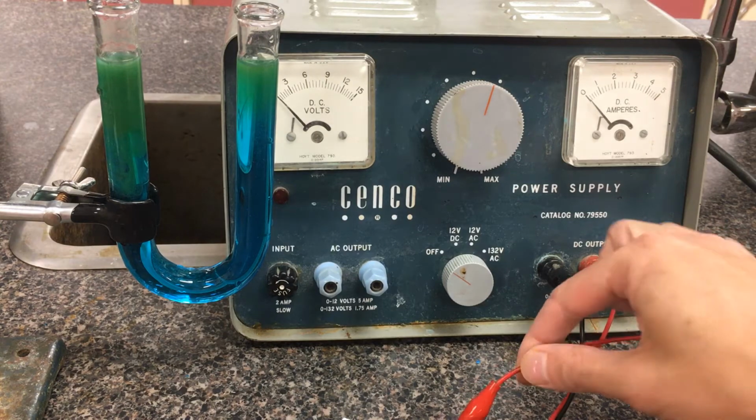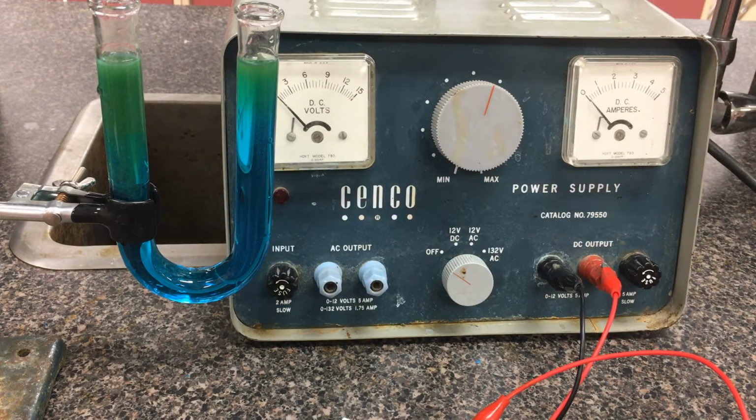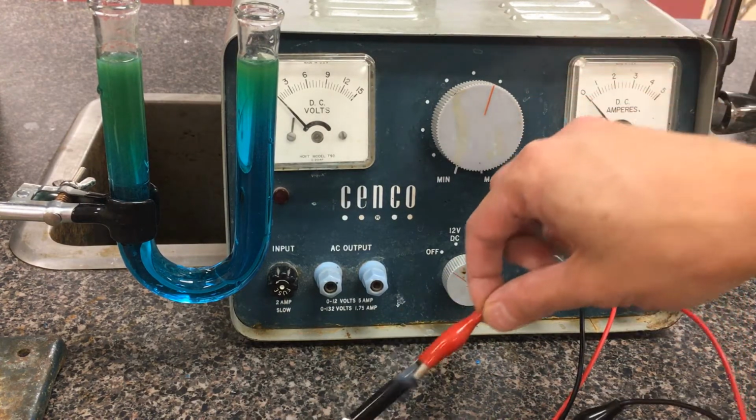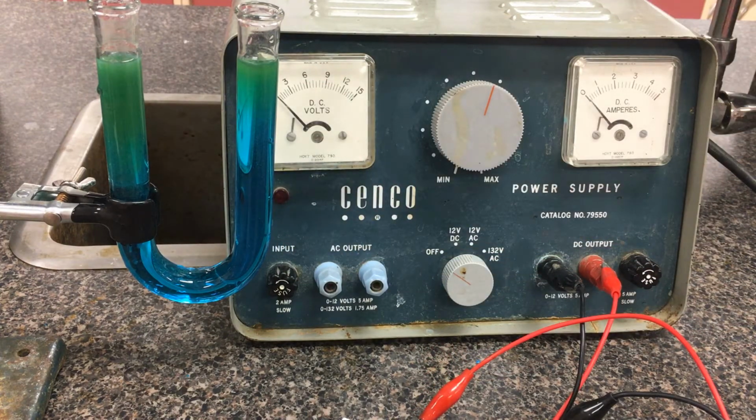We definitely see a little bit of cloudiness that's forming on either side. That cloudiness is indicative that there's a solid that's actually forming. If the surface area on the electrodes were good, the solid can actually deposit directly on the electrode. From the looks of it, it's forming a little bit of a suspension on either side. All right. Thanks, guys.